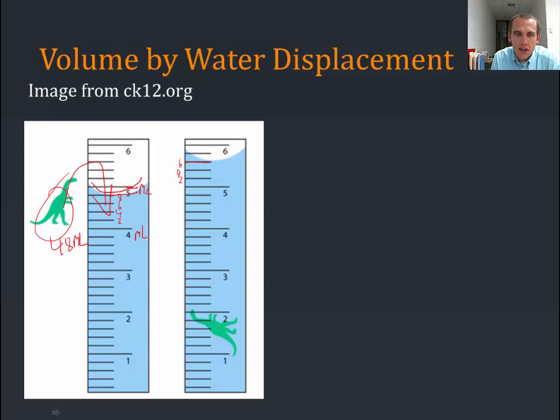There's two, four, six. So this is 5.6 milliliters.